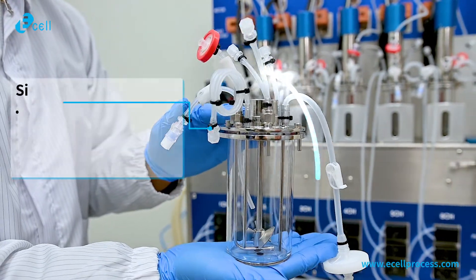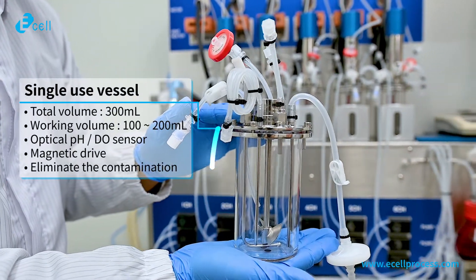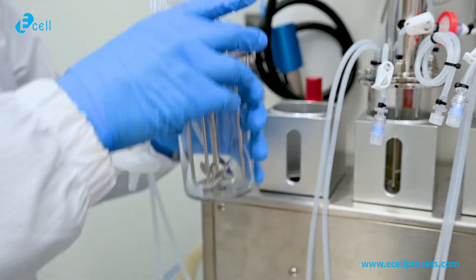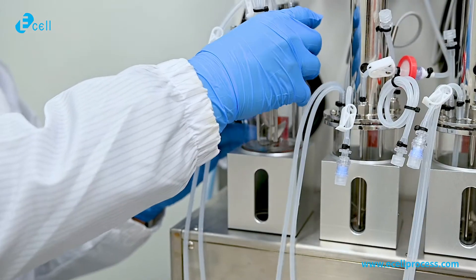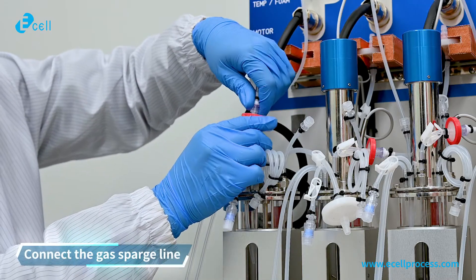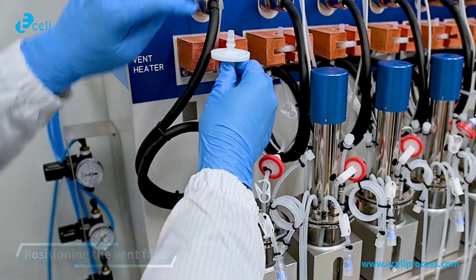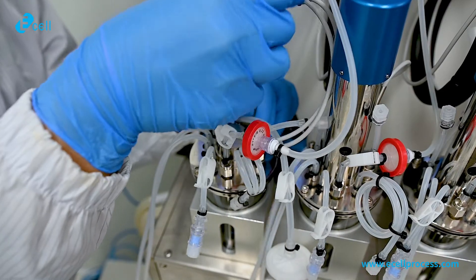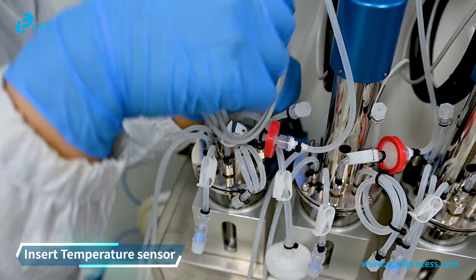Prepare the single-use vessel — pre-gamma irradiation and customizable design. Equip the single-use vessel on each chamber. Connect the gas barge line. Positioning the vent filter. Temperature sensor and motor drive.